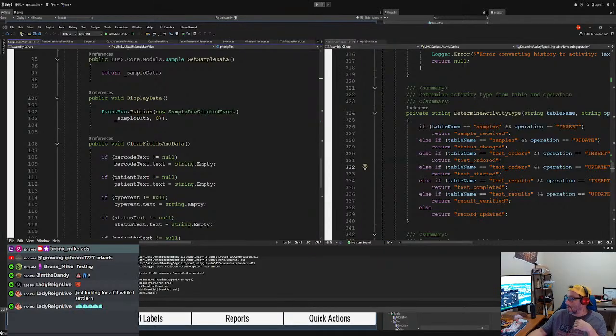All right, folks, I'm kind of exhausted. Got 8 more minutes, we can make it 9 more minutes. Come on, this just takes too long, especially when you're in debug mode.